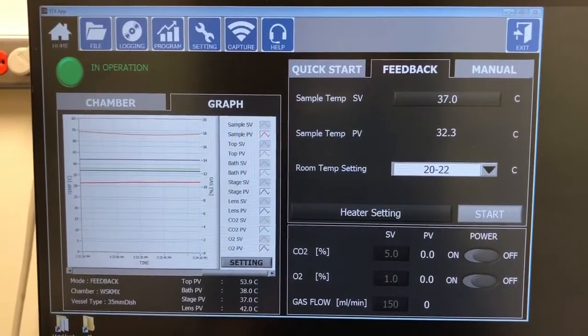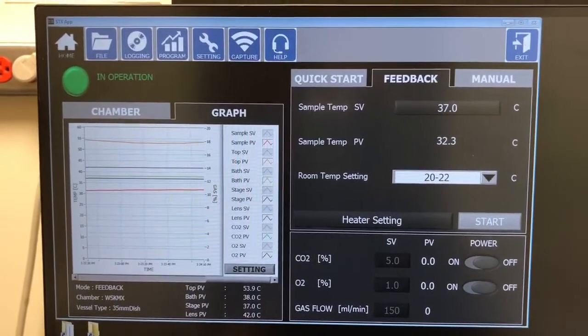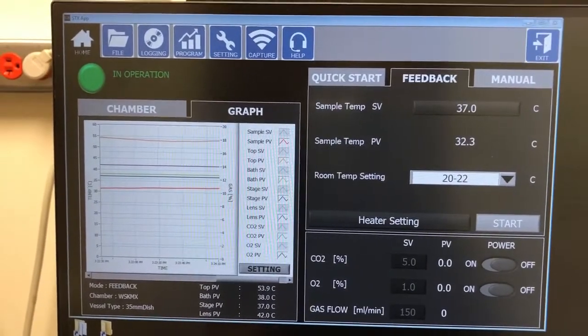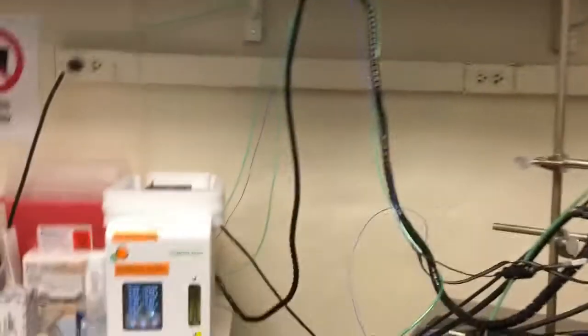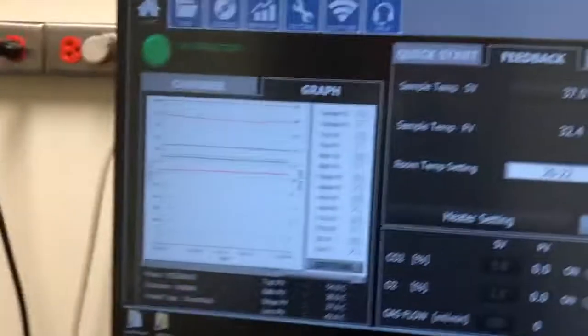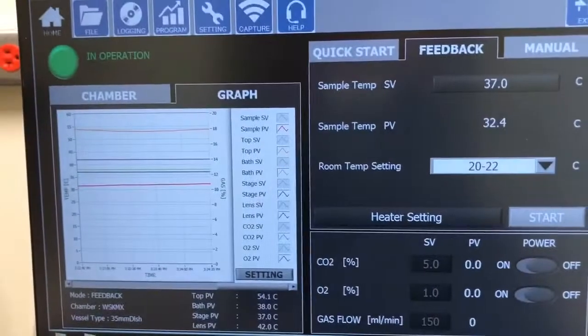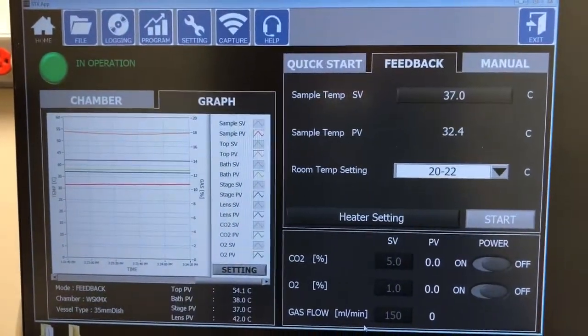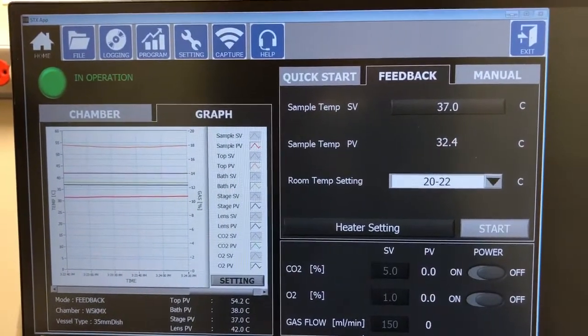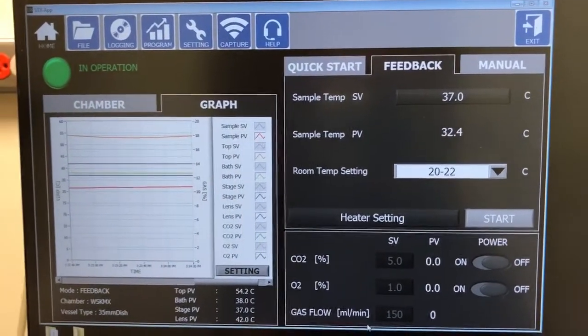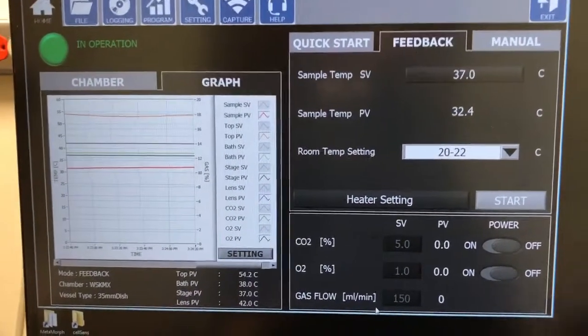The final important thing to note is that when you are using this STX app, it will override anything that's going on there on the Takai kit. So whatever you set here is what's driving the temperature incubator, not whatever you've set necessarily on temperature incubator.